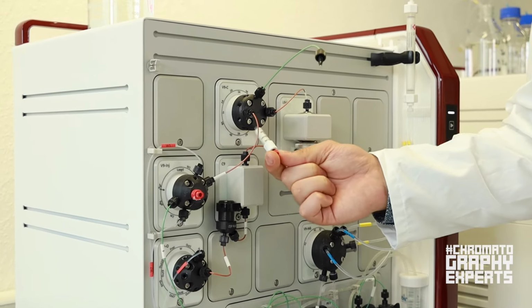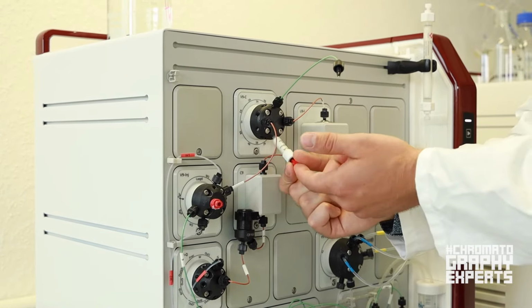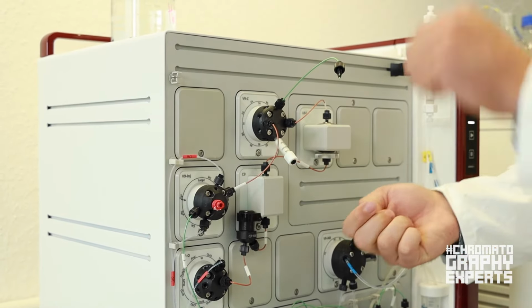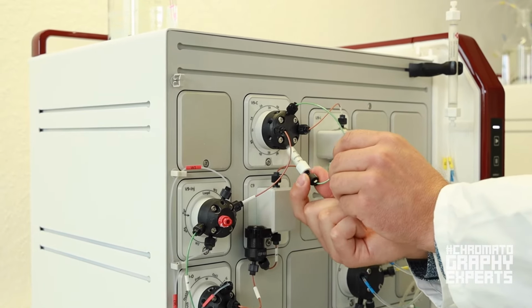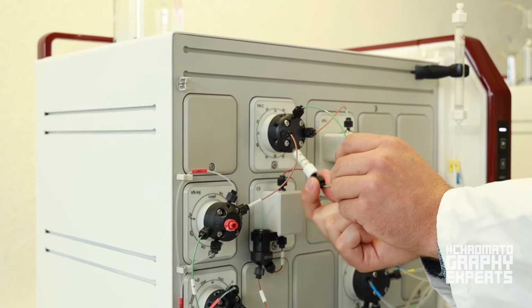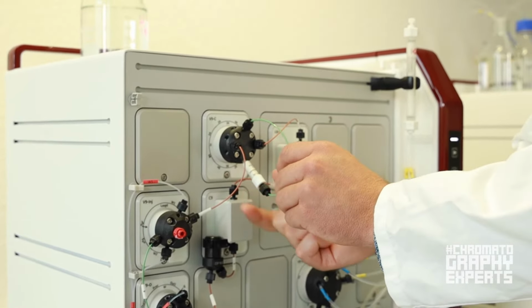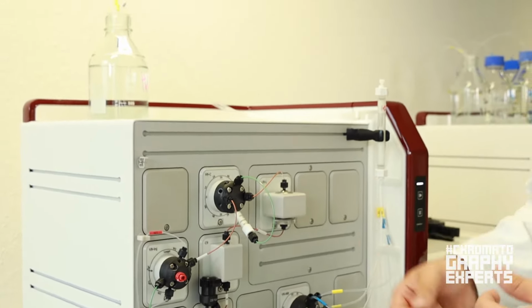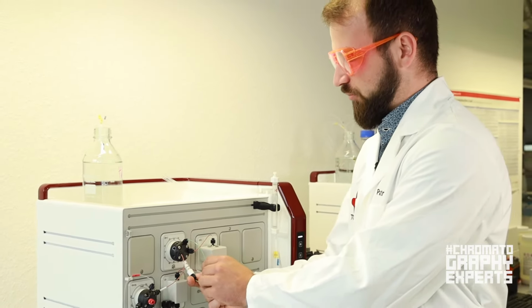Then remove the top plug from the column and connect the tubing to the top end. And that's how easy it is to connect the 1 milliliter column. I will also show you how to disconnect it. Therefore, we just do the same workflow, just the other way around.